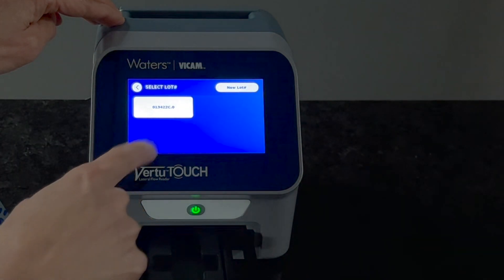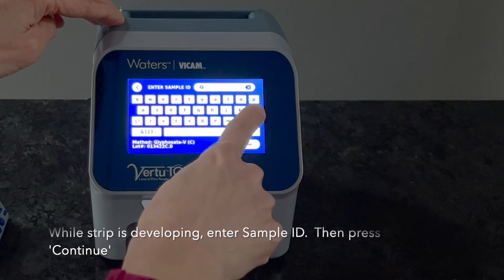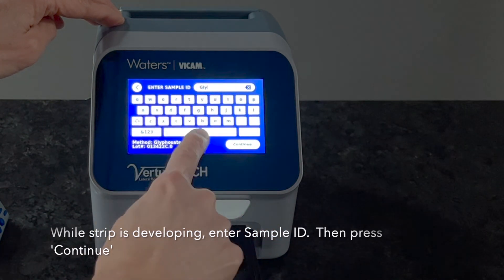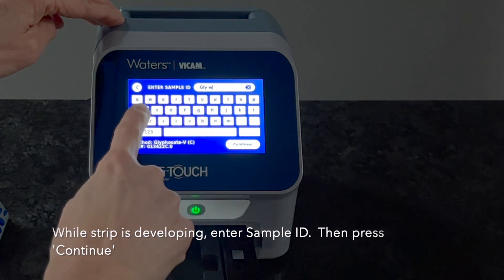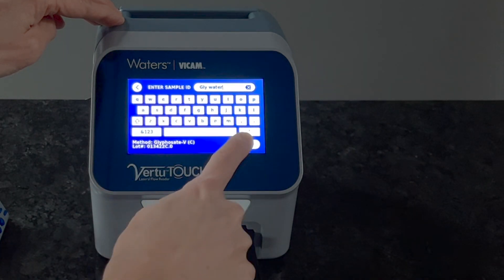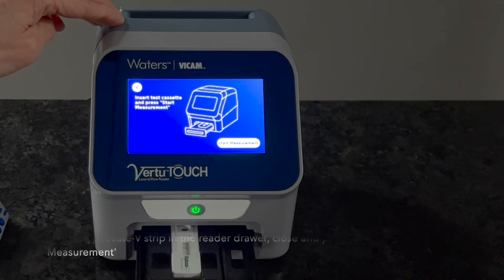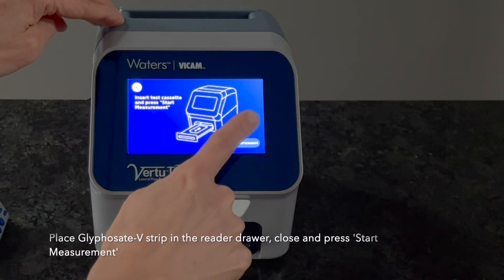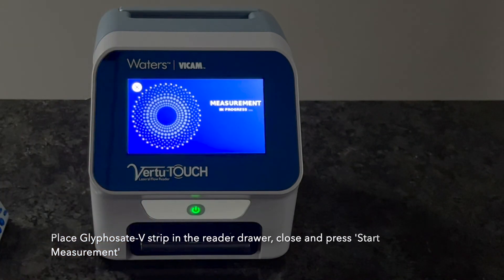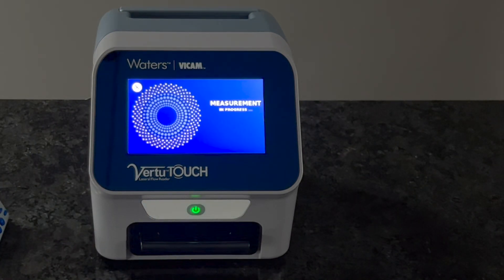While the strip is developing, select the Glyphosate method from the Virtu Touch Reader menu, entering a sample ID when prompted. Open the Virtu Touch Reader sample drawer, placing the Glyphosate V strip into the drawer with the circular sample opening facing towards the reader. Then close the drawer and press continue to analyze the test strip.